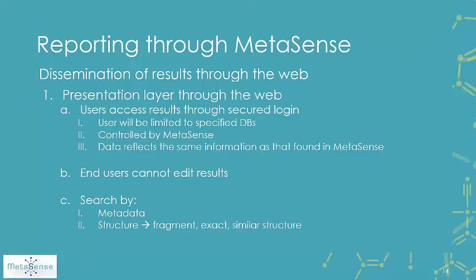Okay, so this is key. Again, it's purely for viewing the results and performing searches. You can search by metadata within the web, as well as by structure, whether it's a fragment search, an exact search, or a similar structure type of search.